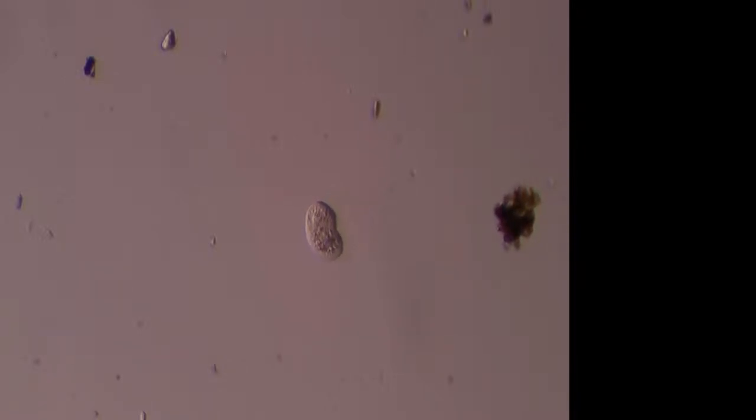So now it's as good at staying in one place for a while. Oh, damn, there's one right to the right of it, too. Look at this. This one is actually stationary, which might mean it turns out like the other ones we've been watching have done. This might be another one dying. Once they stop moving like this, it's usually not a good sign.